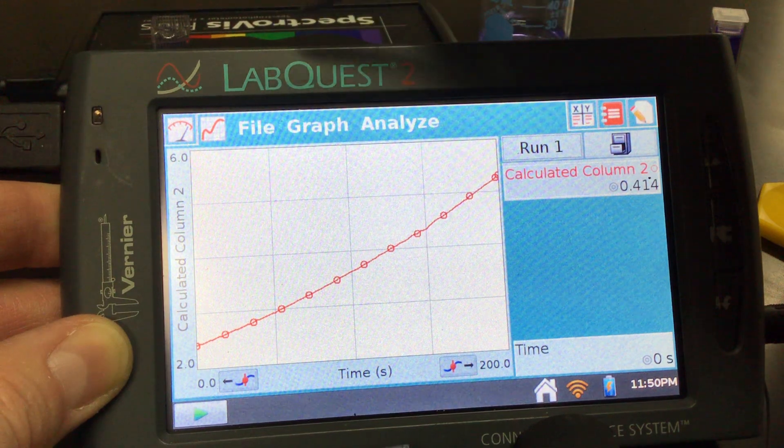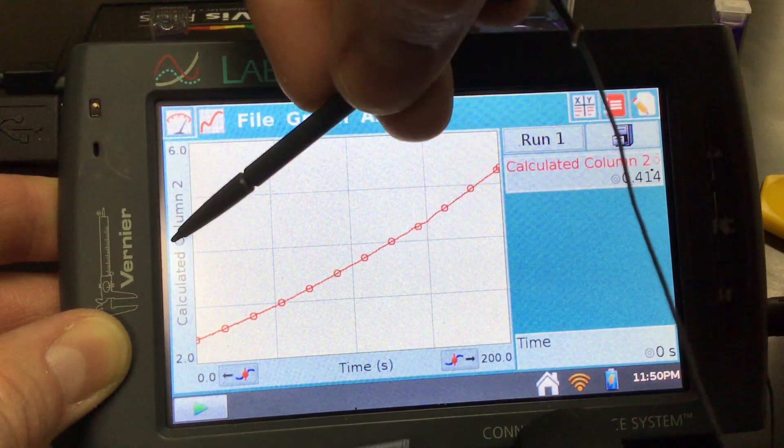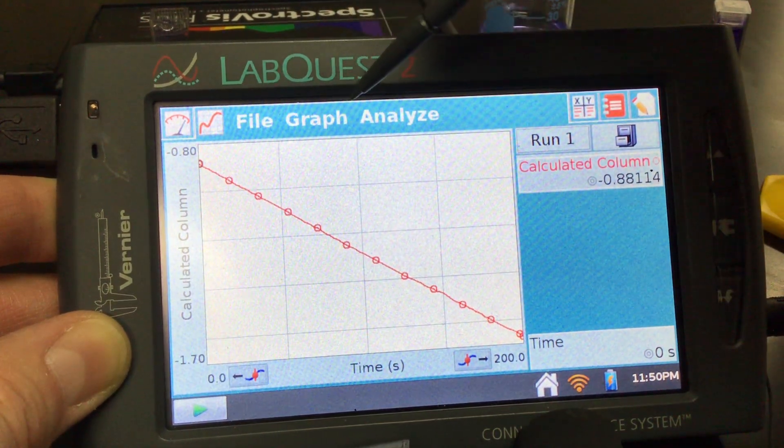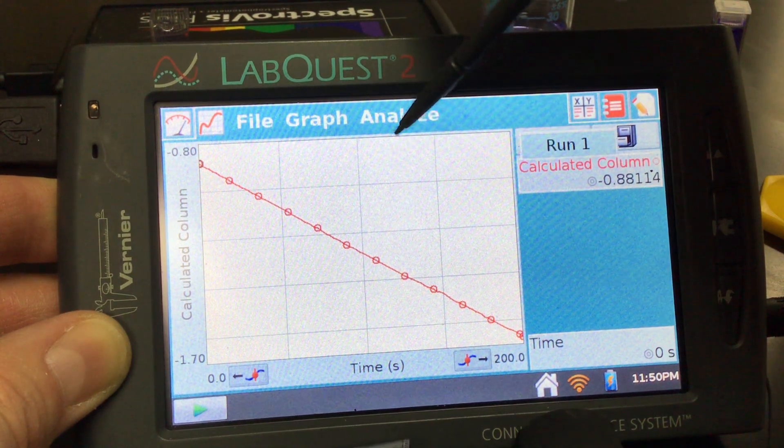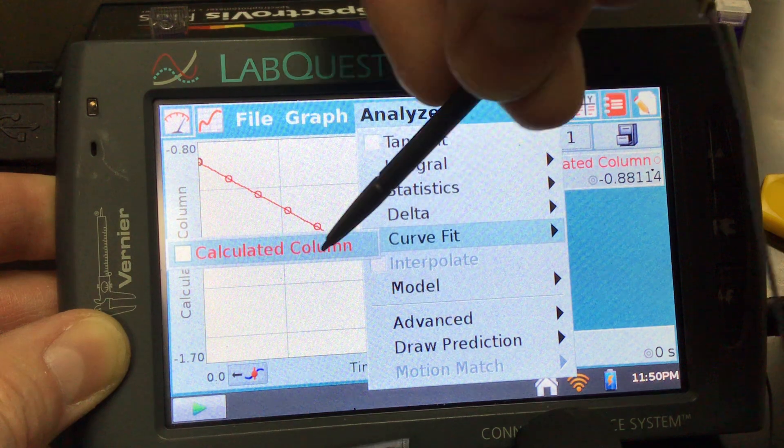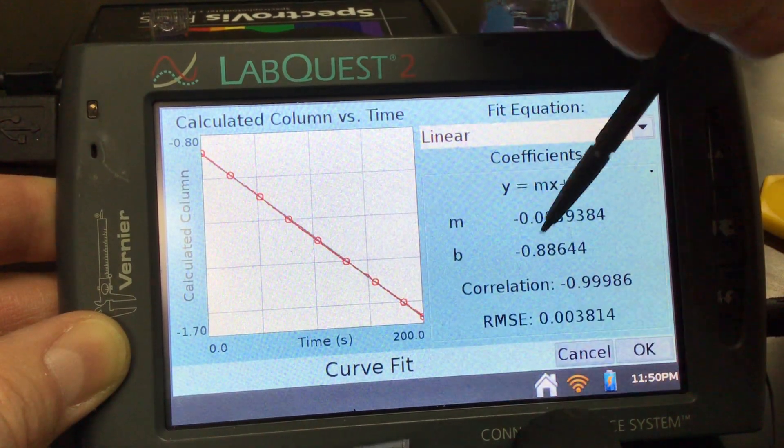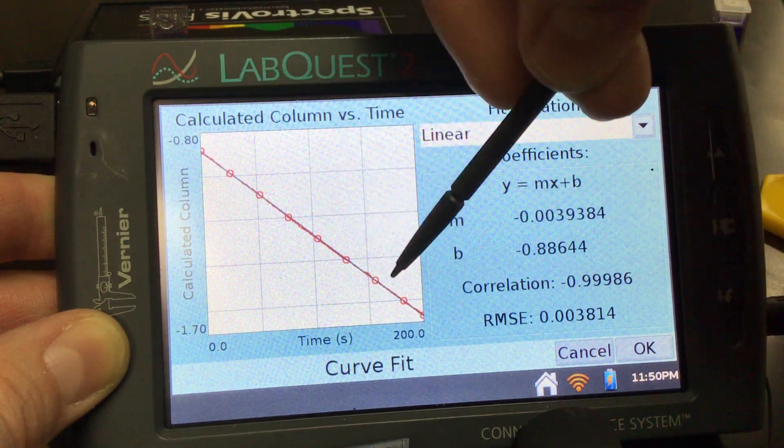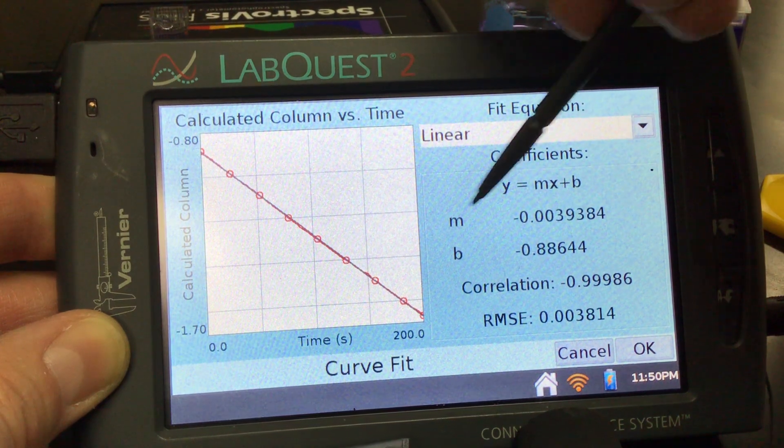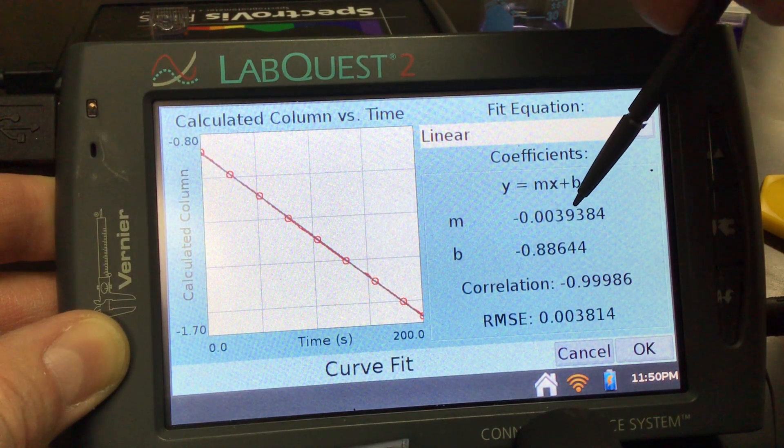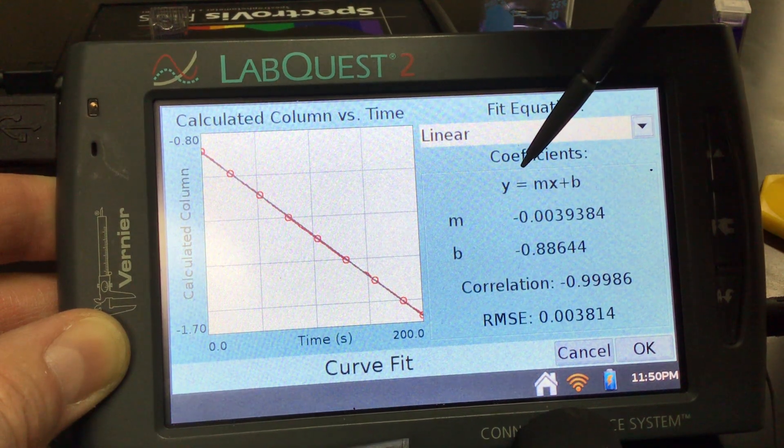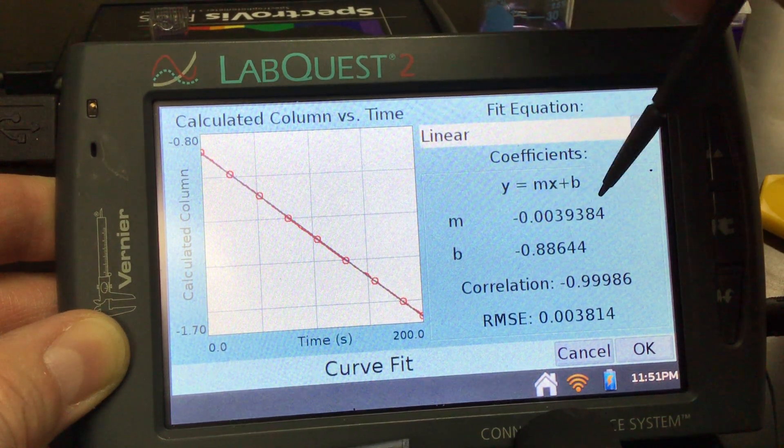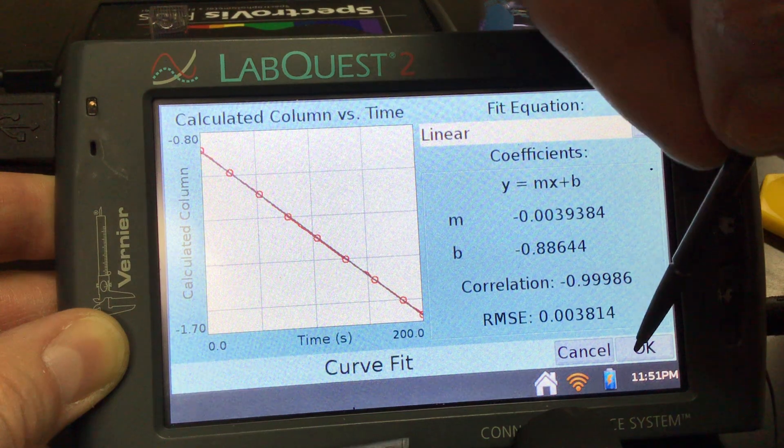One tip for you to switch back and forth is you just want to tap on the y-axis. We can go back to our first calculated column which is the natural log data, and we can analyze it, get the curve fit, the linear fit. What we want to remember is the relationship between the slope here and the rate constant. Your slope is your rate constant, so another piece of valuable data. Graphing this with a natural log function not only tells us the order but also tells us the rate constant of our reaction.